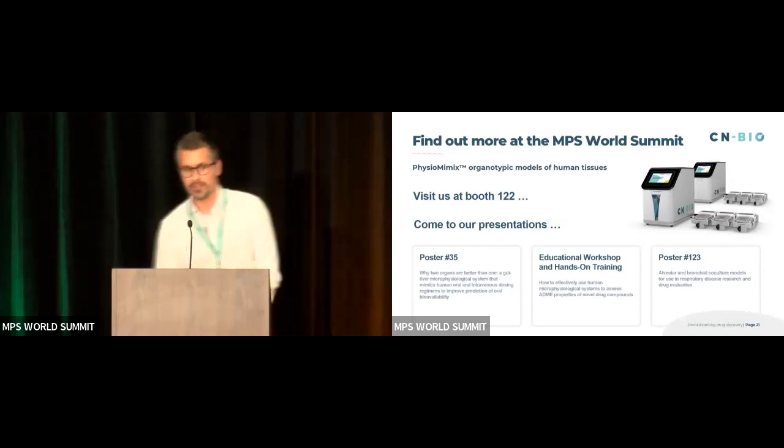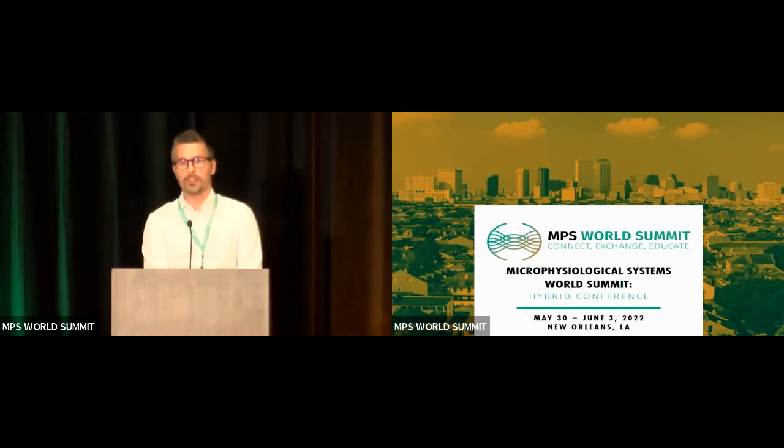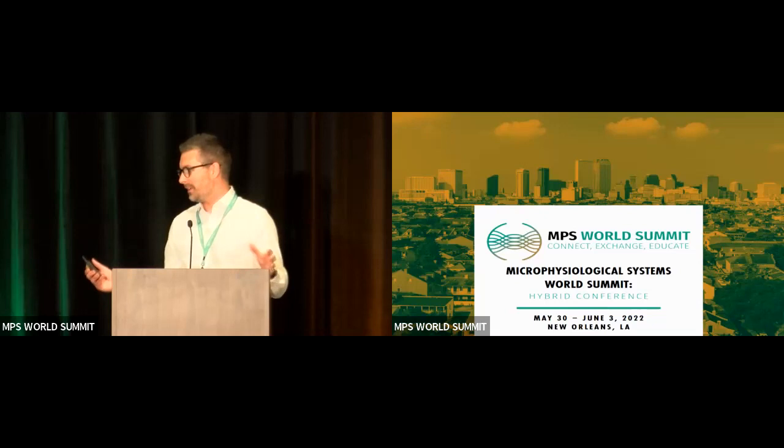Well, thank you for your talk. I have a small question, if I may. So how did you quantify reproducibility in your MPS? That's a great question. We really just looked at the ability for the microtissues to form across multiple wells, multiple plates, as I say, across multiple sites, and with multiple cell sources. We didn't do a deep statistical analysis to determine specific numbers that we should look at. But when we looked across a range of plates, range of sites, range of owners, we see greater than 90% of all the microtissues are the same.